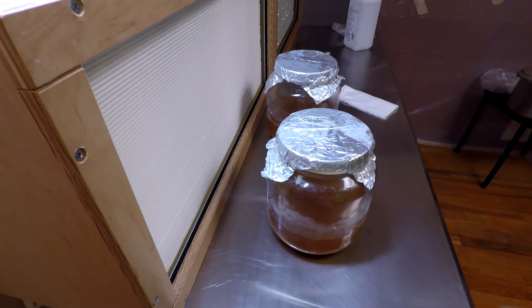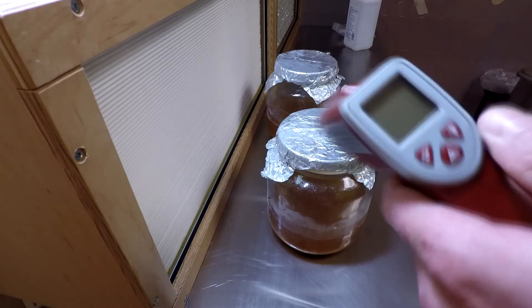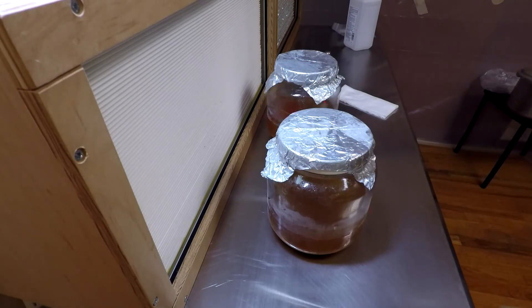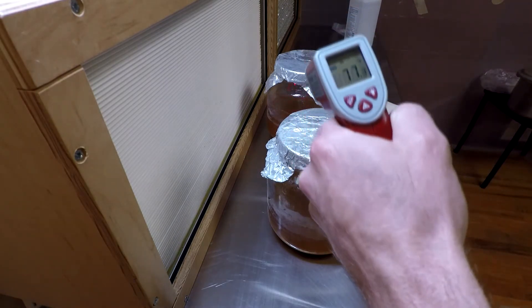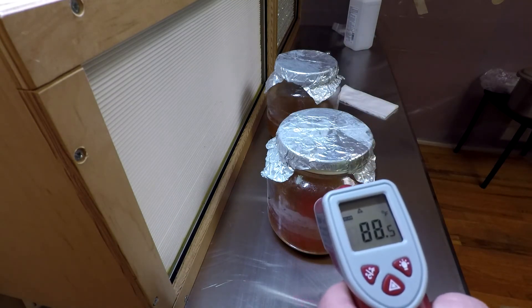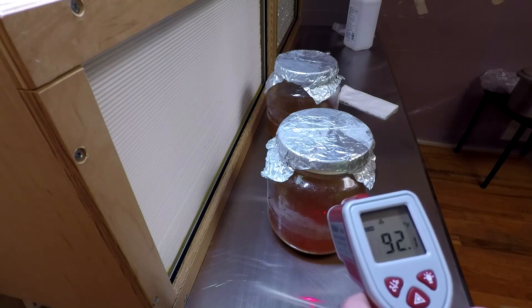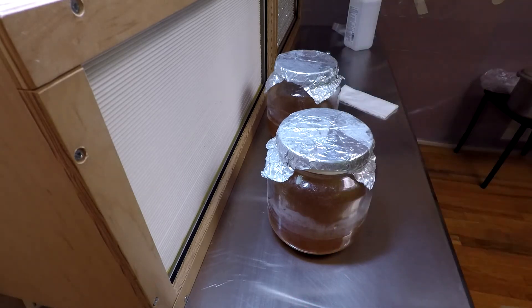I'm waiting for these jars to cool down enough to inoculate them. I really like using this infrared temperature reader — I can shine it on the first jar and it reads 77 degrees, and on the second one it's around 90 to 95 degrees. It's a great tool to know when the temperature is cool enough. I'm going to wait until it gets down to at least 85 degrees or under before inoculating.